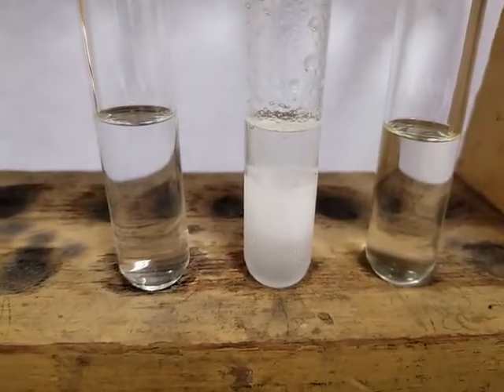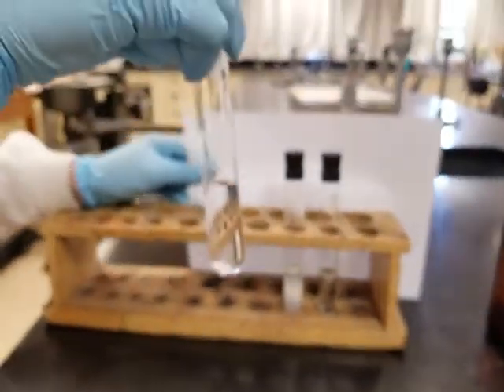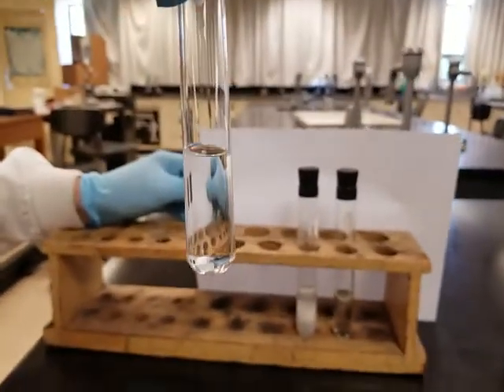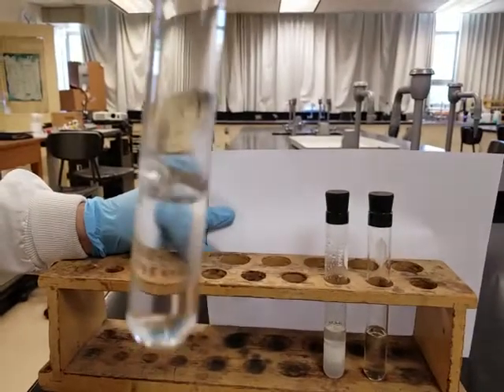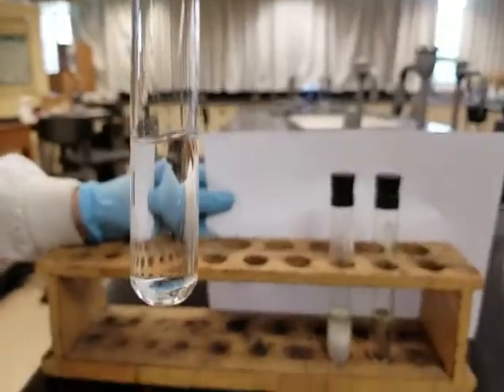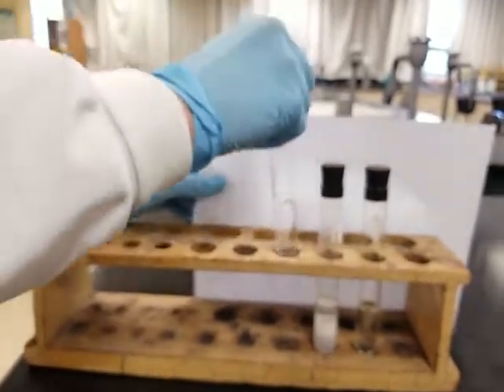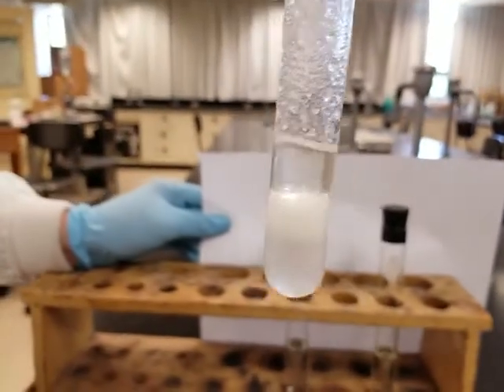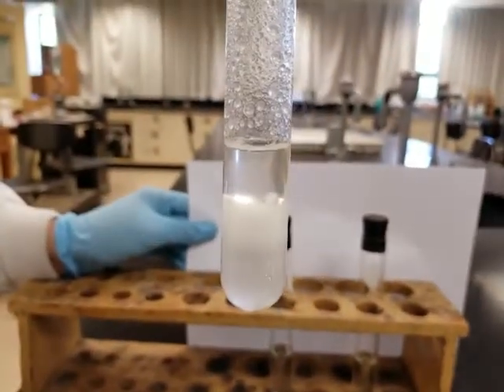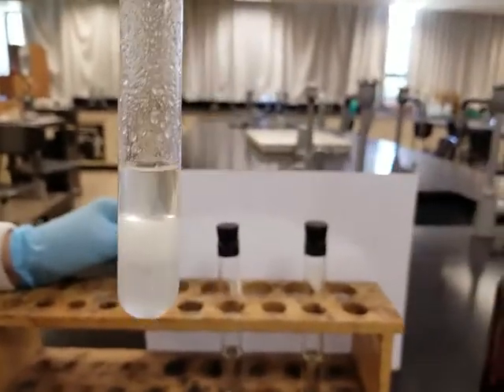So let's take a look at our water and isopropyl alcohol. Do you see an interface, or do you see one homogeneous liquid over here? You decide. That's water and isopropyl alcohol. Number 2, water and kerosene. Do you see one homogeneous layer of liquid, or do you see a separation and an interface?